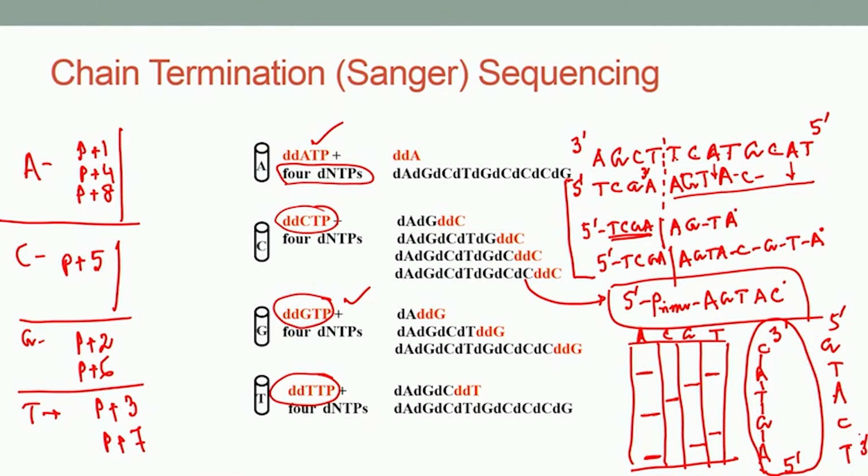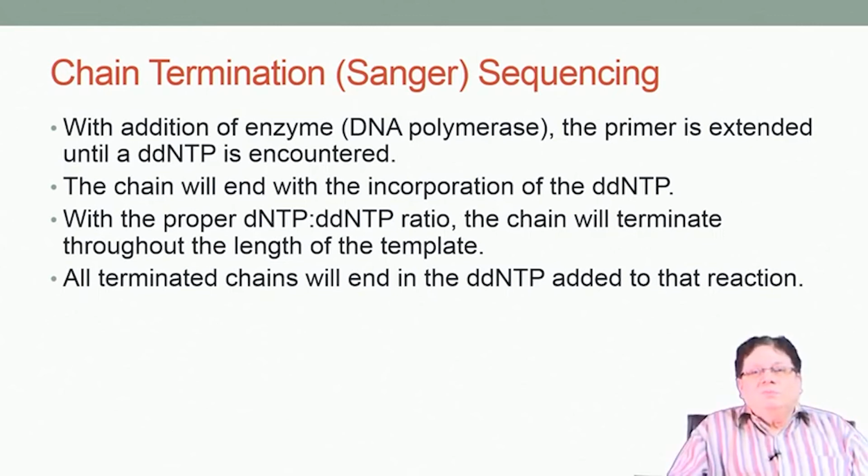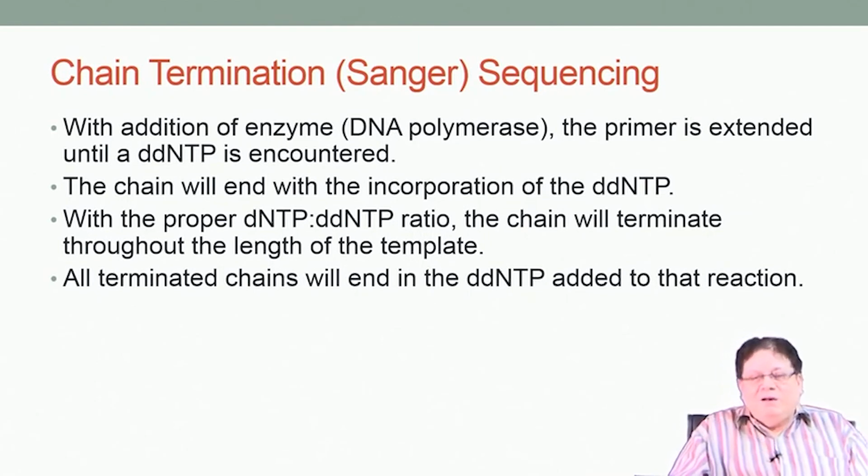This is a very intelligent way of doing the sequencing, because this Sanger's method, using dideoxy nucleoside, ultimately showed the way how to make antiviral compounds. That we will discuss when we go to the medicinal chemistry part, but many of the antiviral drugs that we have today are literally based on this principle of using the dideoxy nucleoside.